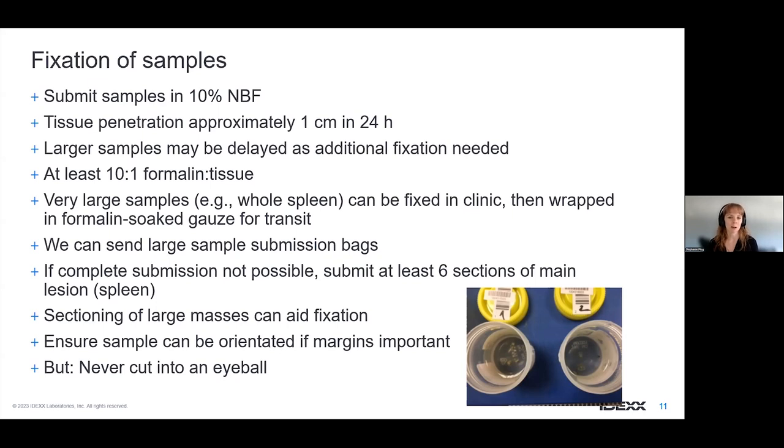There's always someone who can help you. It's not so uncommon to get these questions, where we get a call and we are told, I've just removed a large leg from a greyhound and I don't have a box that's big enough, I don't have enough formalin, what to do? So there are ways we can help you with that.